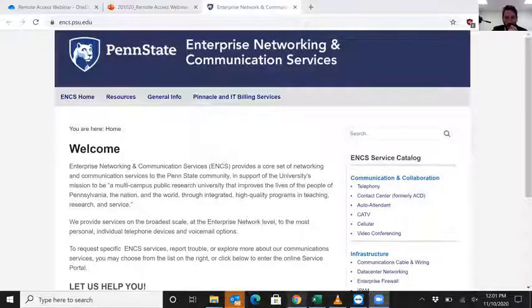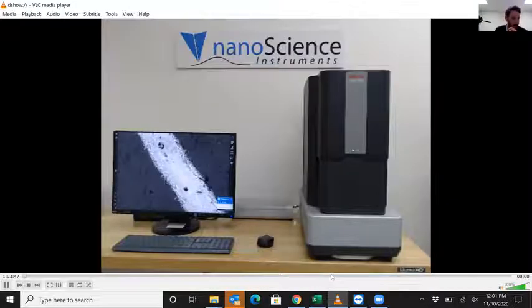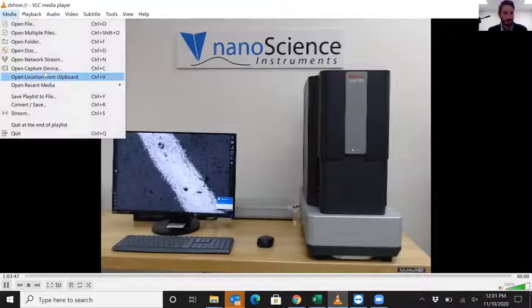Right. And people were interested in the compactness of your system. They were asking, where's the vacuum pump in there? Yeah, let me see if I can share my screen here. Let me show you guys real quick. So I'm sharing my screen again. Can you guys all see that? Okay, cool. I'm going to move this camera down here for a second, and I've got to plug it in. I'll show you guys where the pump is. It's just a small red diaphragm pump, a little mechanical backing pump.